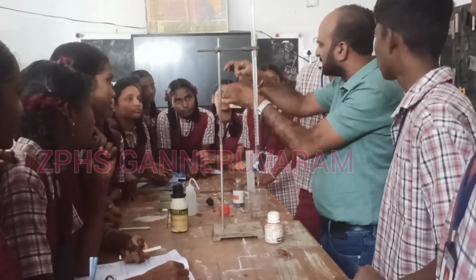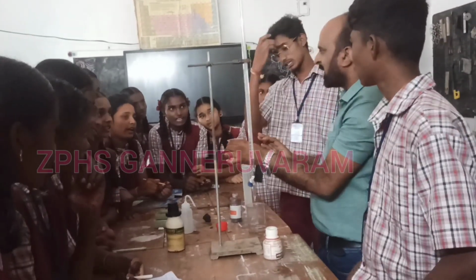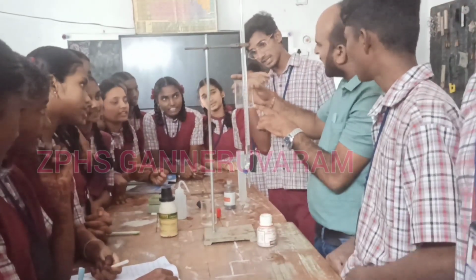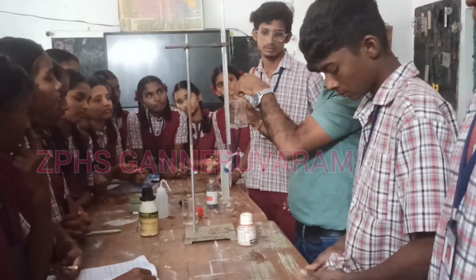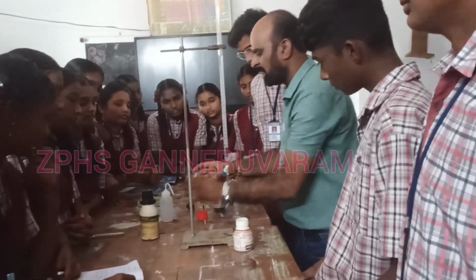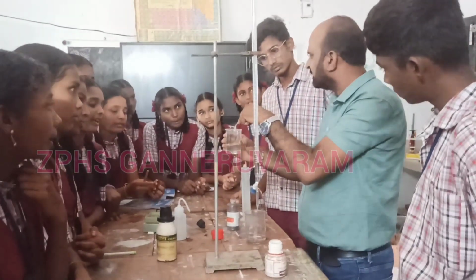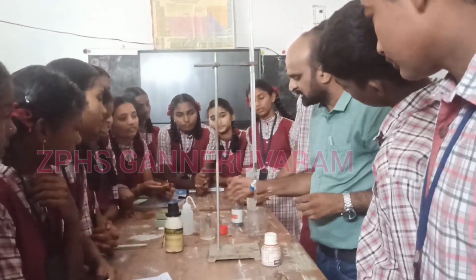So what is the solution? Sodium hydroxide. So what is the nature of this solution? Base. And what is the nature of this solution? Acid. In the acid, when I keep the pH paper, it turns to red color. When I kept the pH paper in the sodium hydroxide solution, it turns to blue color. So that's why this is the base and this is acid.